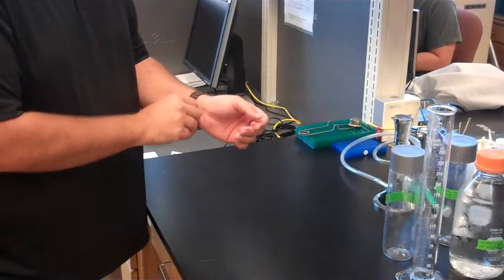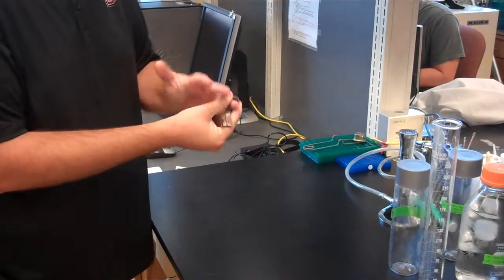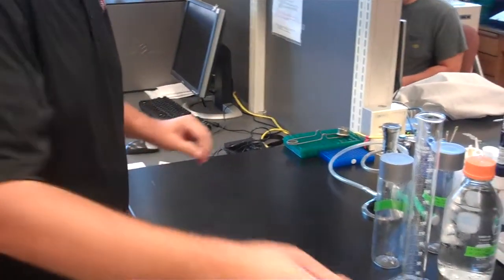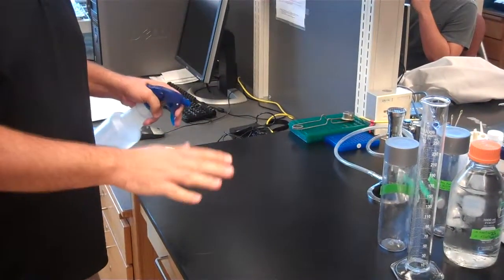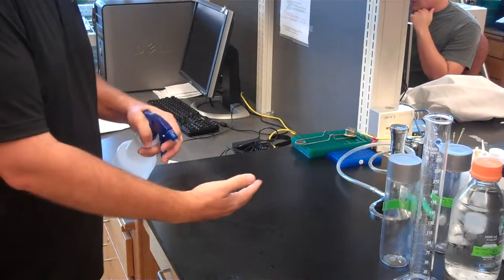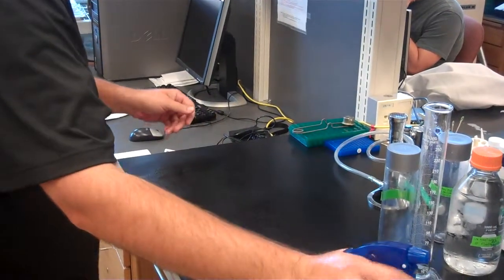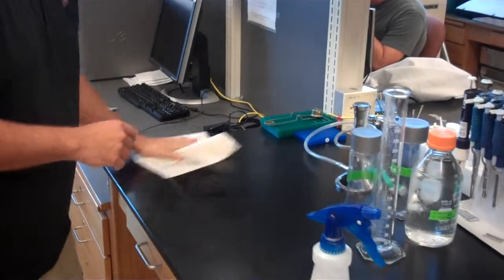Okay, so the first thing I'm going to do is take off my watch and jewelry. Even though the ring can take the ethanol, I really don't want to spray my watch down with ethanol before I start. So what I'm going to use here is some 70% ethanol in a spray bottle. And I'm going to spray my working space down. I'm going to spray my hands down. Take a paper towel, we're going to wipe everything down just a little bit, just let it dry and evaporate.